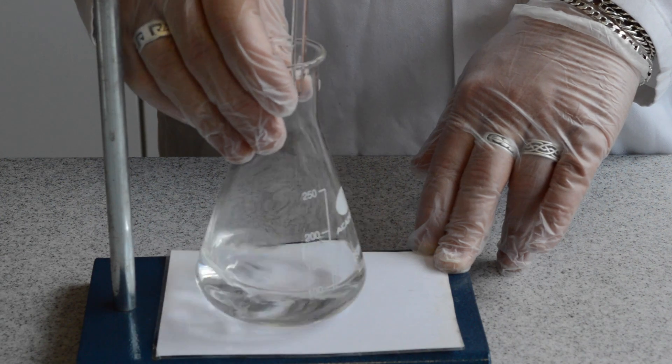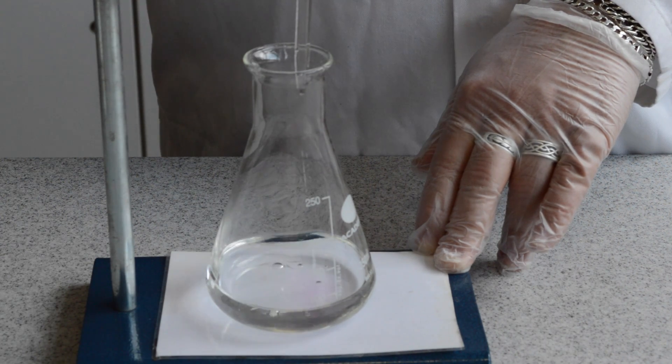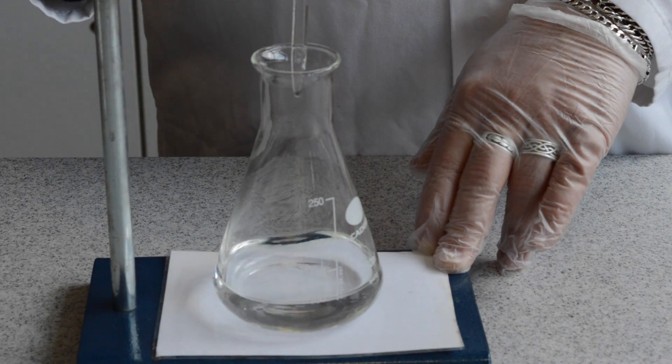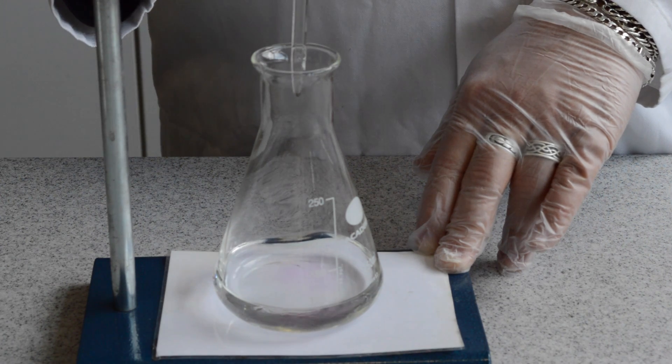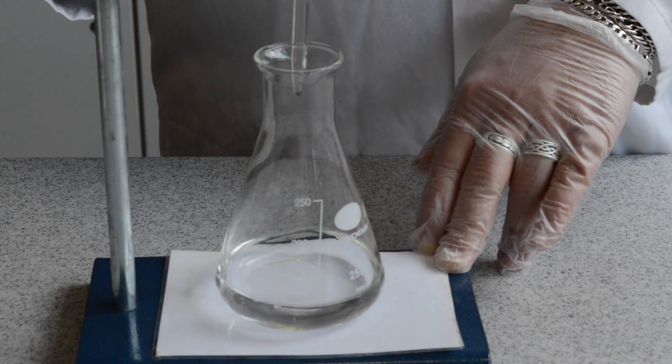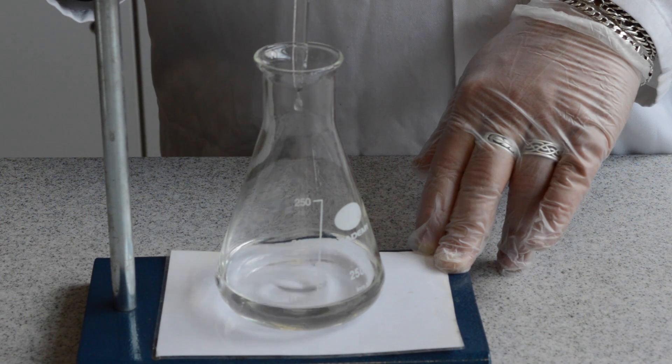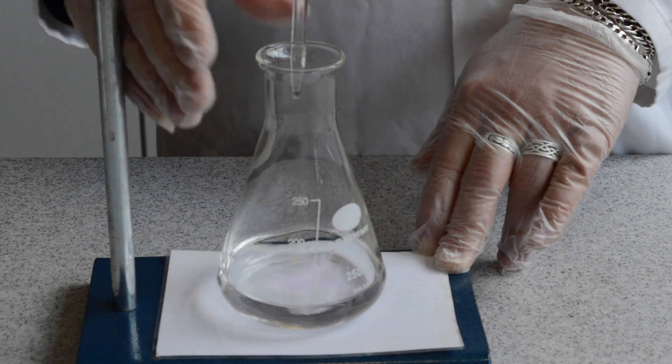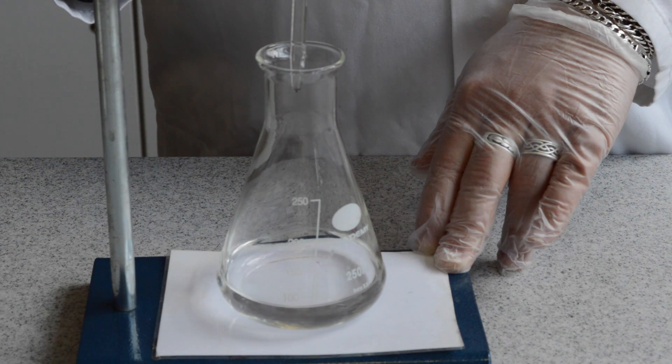Nearing the end point of the titration, you may notice that the indicator starts to show some colour change. This will disappear as you swirl the flask. This indicates that the end point of the titration is being reached. Add increasingly smaller amounts of the sodium hydroxide. This can be added dropwise as the end point approaches.